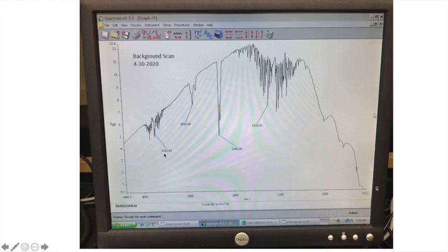So what's here around 3,742? It's actually water. Now, you might think, that doesn't look like water should look. You'd think it would have a regular parabolic OH signal, but this isn't normal water that we're used to seeing, or normal alcohol we're used to seeing. This is gaseous water. So gaseous water is going to behave differently than liquid water. And that's because gaseous water molecules are far apart from each other and they're not hydrogen bonding like in a liquid. So what's causing that?